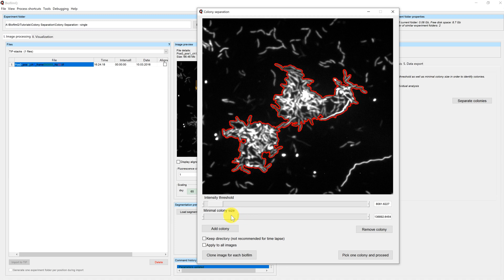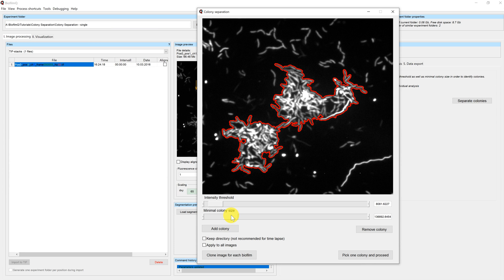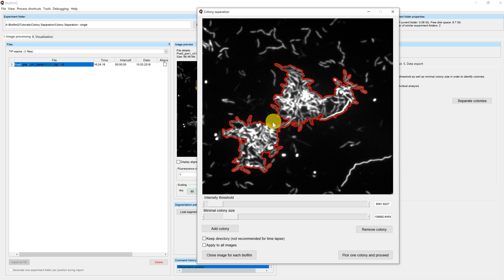Once you found a good setting for the slider values, you can use the buttons below the sliders to manually modify the selection mask. In this case, we can see that the two microcolonies are connected by a small area in between.